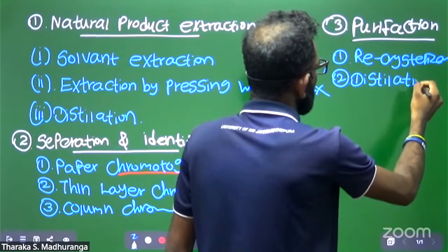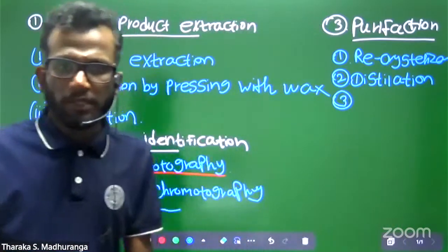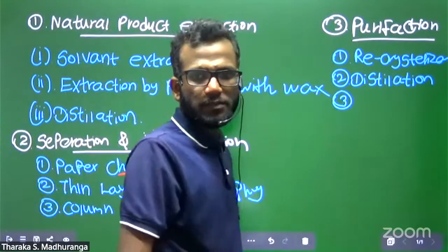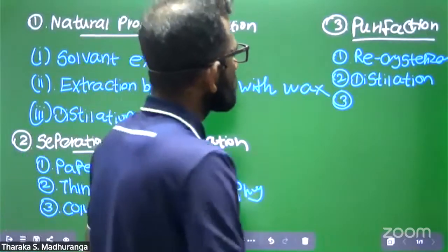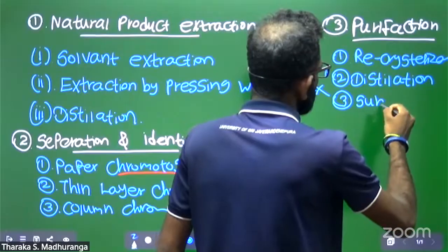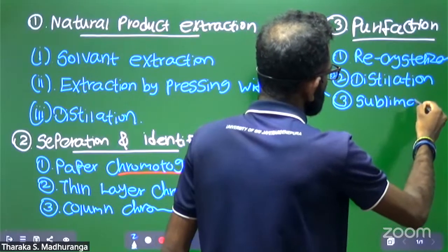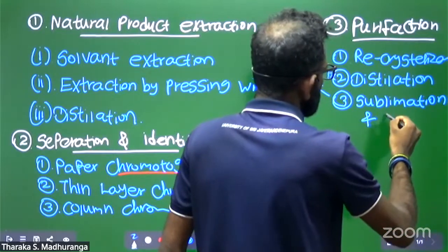The final purification method is sublimation and deposition.